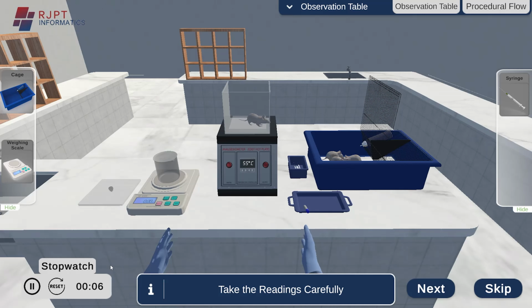The timer has been started and it moves forward much further than the basal reaction. We will perform this step 3 times, so that we can write a mean value of this time interval and have an accurate value.